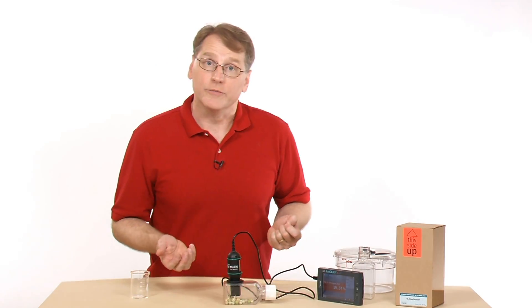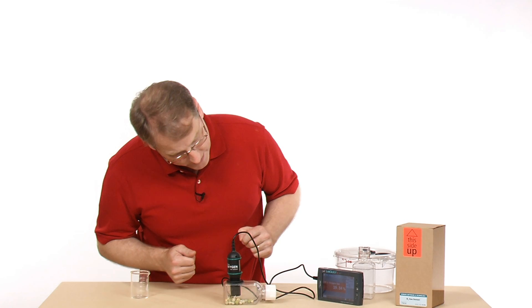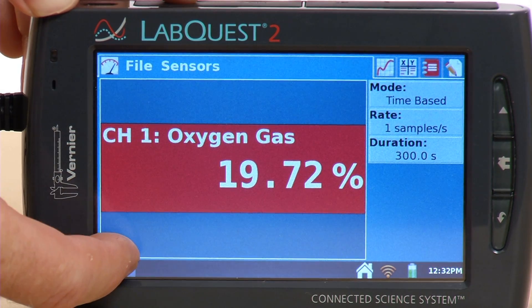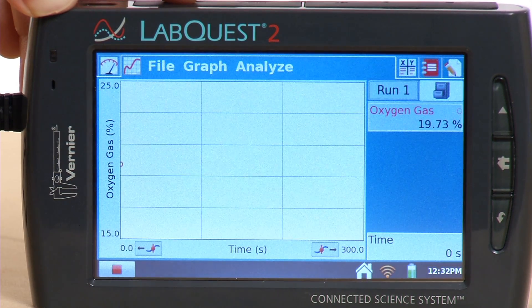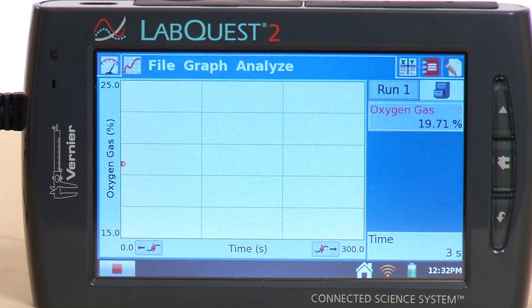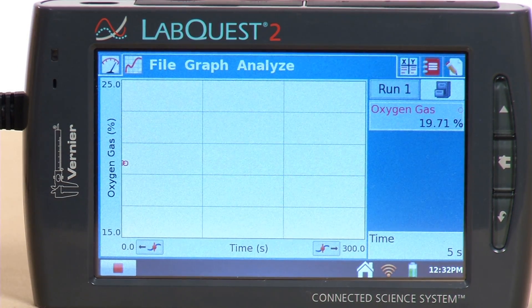So we're now ready to collect some data. So I'm just going to hit Collect. It slides over to the graph, and is now going to collect data for five minutes.